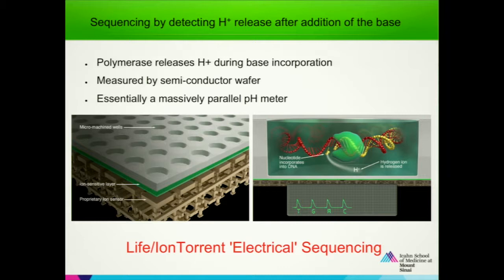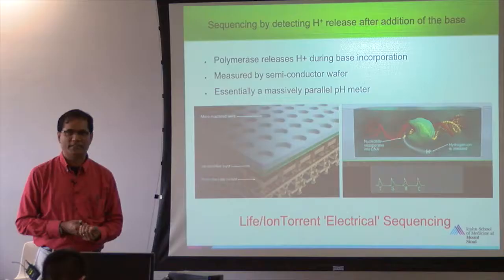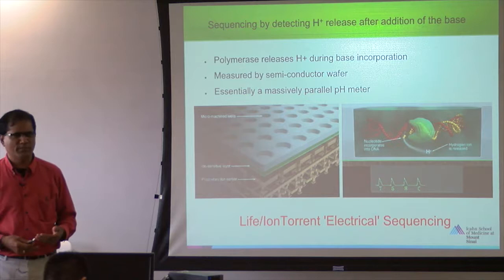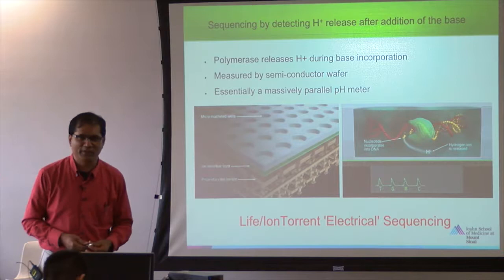So that's why it was developed, and from billions it came to millions, and it took a month or two to sequence the entire human genome. But even if you say million wells, if you want to go below that, what do you do? 10 million now? But now the nanotechnology is the problem. 10 million wells, doing the reaction in those small wells, it's a pain. It was tough. So the creation of the wells should not become a limitation to increasing throughput, because imagine spending a couple of million dollars for another human genome is cheaper than the $3 billion, but it is still not practically usable.